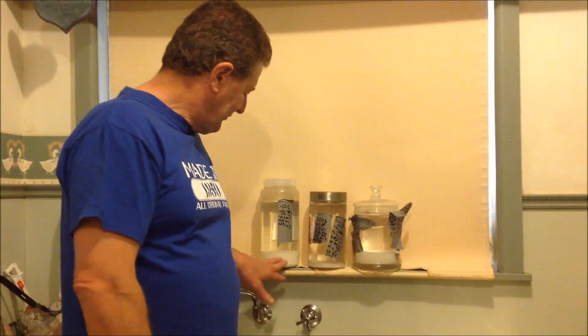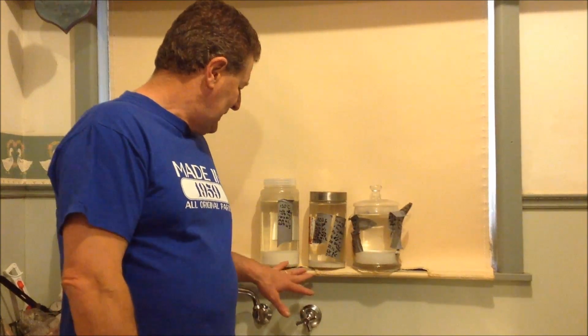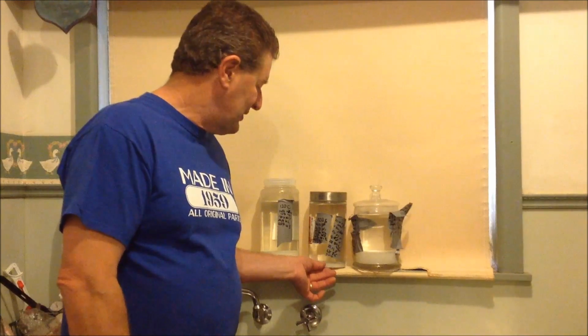The idea is to compare how much precipitate we got in each stage and try and do a couple more experiments after this to see whether there was any difference in the precipitate. The idea that's beginning to emerge in my mind from the experiments is that what you see with your eye is mostly magnesium hydroxide, and the reason why it's less on the second stage precipitate is of course because you're not going to quite as high pH, and supposedly that's the end state that you're getting.